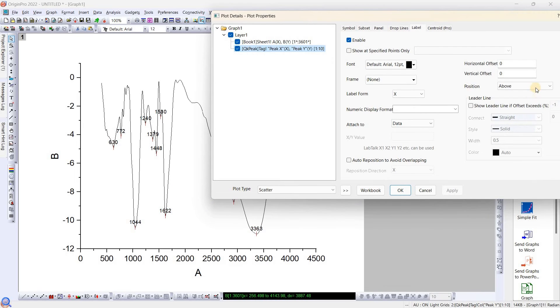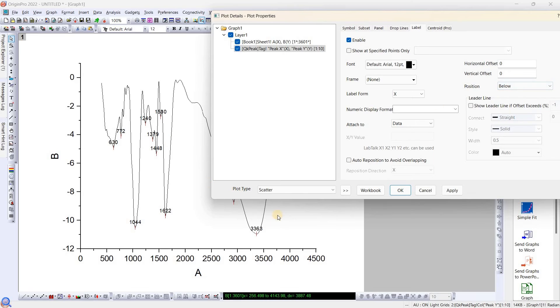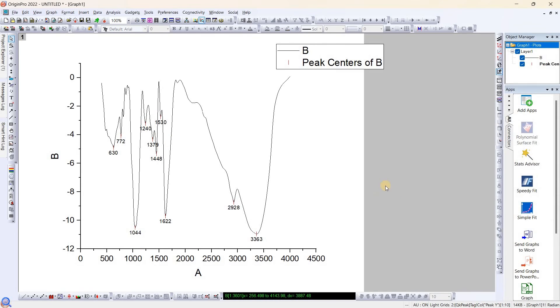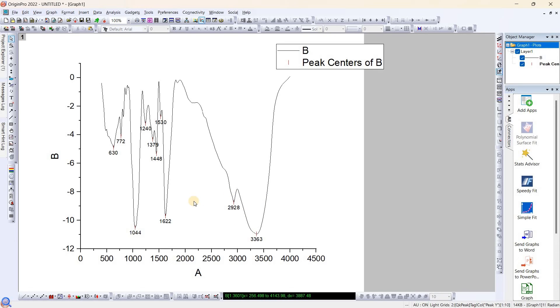Now one thing we can do is we can plot this one below the drop line. Again, you can make with the offset and various settings you can play with this. And this is the quickest method you can find the peak and label them.